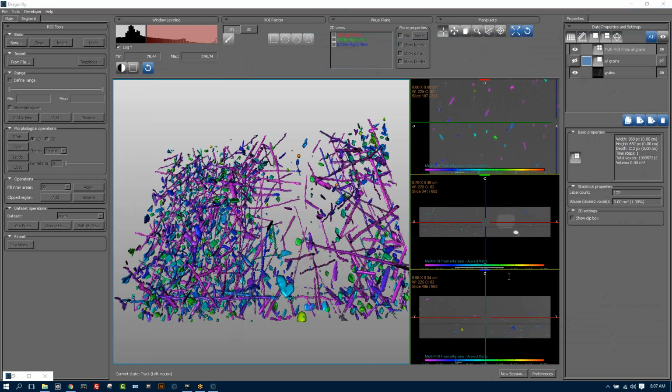So Martin asks the question, are there any thoughts on uncertainty quantification at gray levels? So I guess it really depends on the application and the experimental setup. So you could have a number of segmented objects, and then you could compute the mean and standard deviation and look at the distribution of gray level inside the segmented objects. You could also be concerned about how the distribution of gray level may introduce uncertainty when you're doing the segmentation.